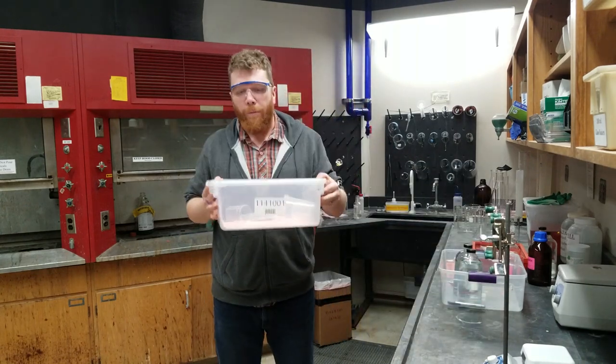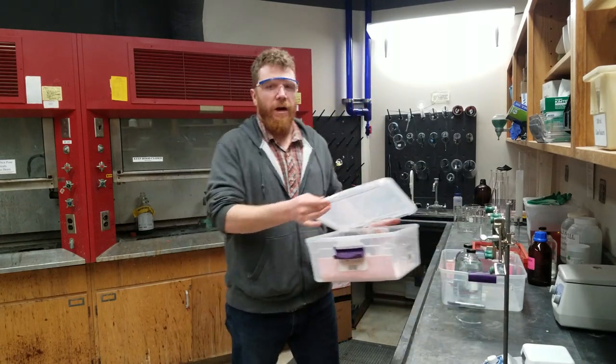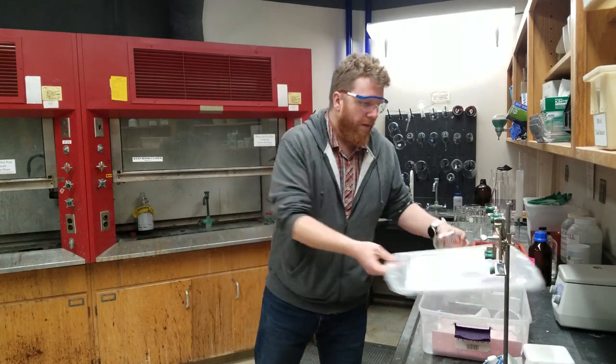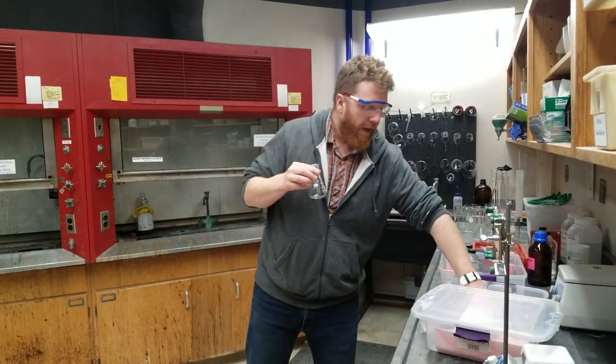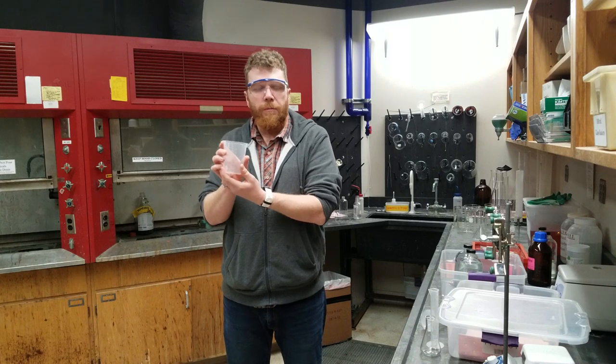I want to talk to you about your bin. This week in your bin, you're going to have the following items: a 150 milliliter glass beaker, a plastic bottle, a 125 milliliter Erlenmeyer flask, a 50 milliliter graduated cylinder, and finally a 400 milliliter plastic beaker.